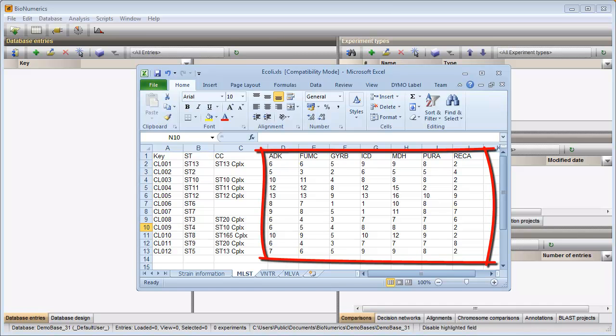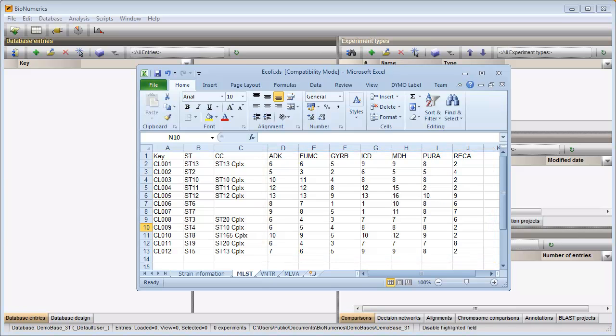These values will be stored in a character type experiment. In Excel it is possible to save a range of cells. This might be of interest if you only want to import part of the information that is present in a sheet.